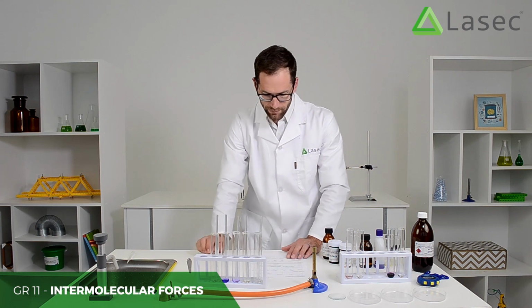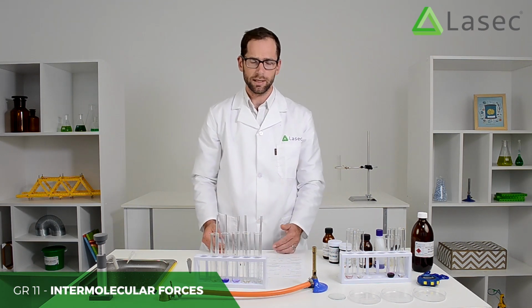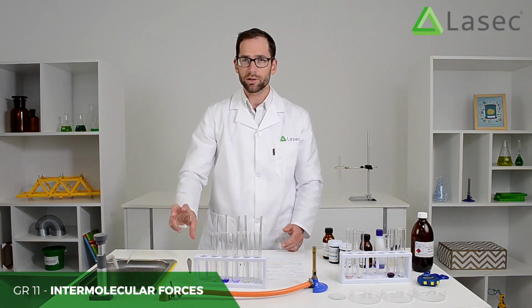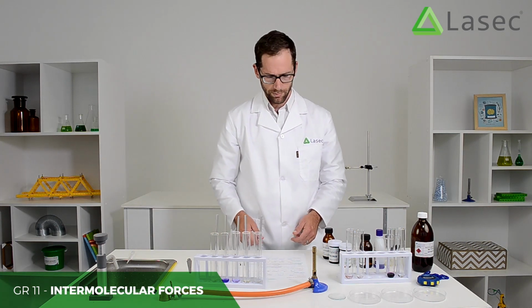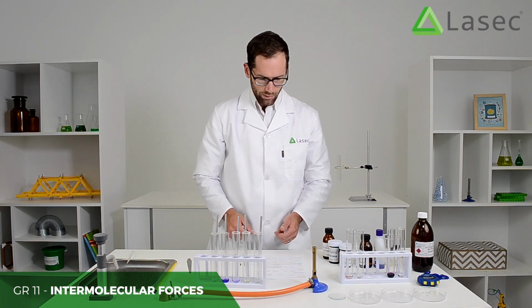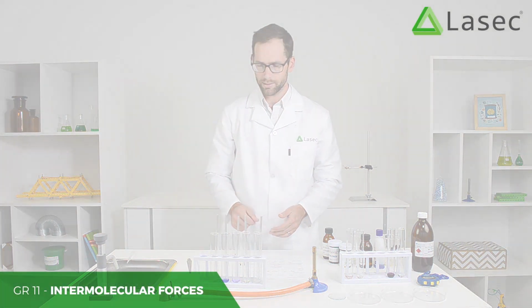Then boiling points. Here with olive oil and glycerine, they've got very high boiling points, so we can't heat that up enough in the lab just on a normal spirit burner. And if the learners are heating it to that kind of temperature, you do risk burns and things, going up to like 290 degrees Celsius with glycerine. So with water, ethanol, and nail polish remover, I'm just going to set up for that, and we're going to quickly take a look at boiling points.